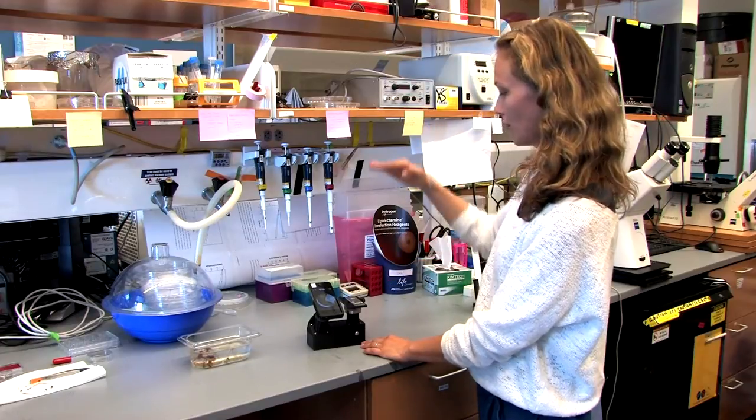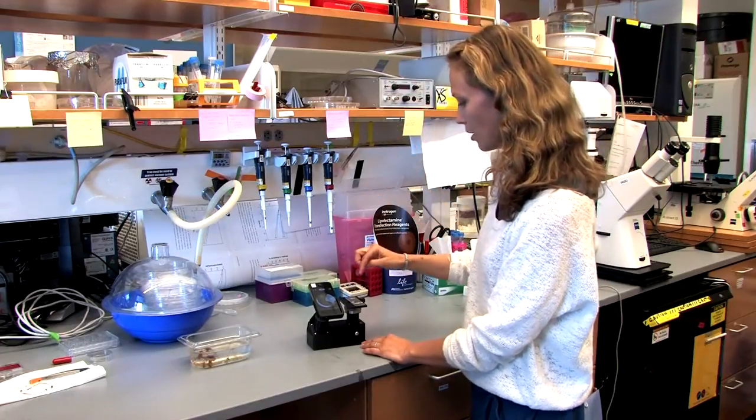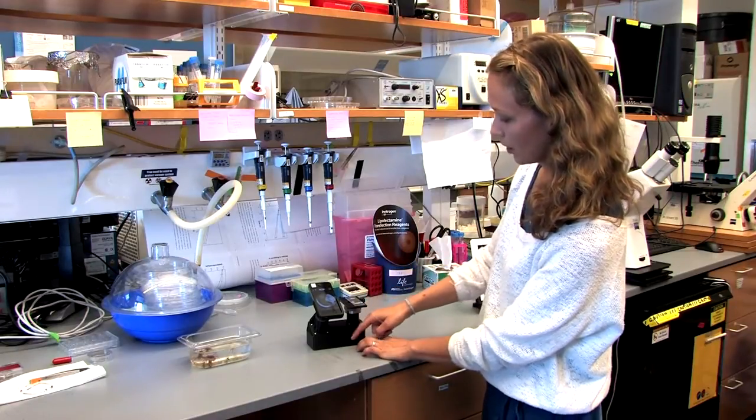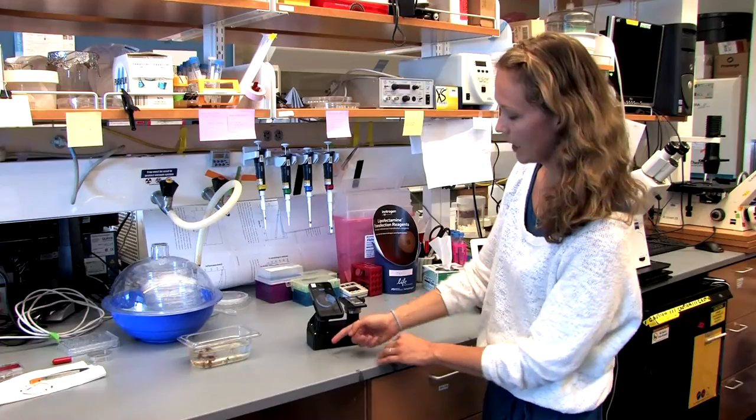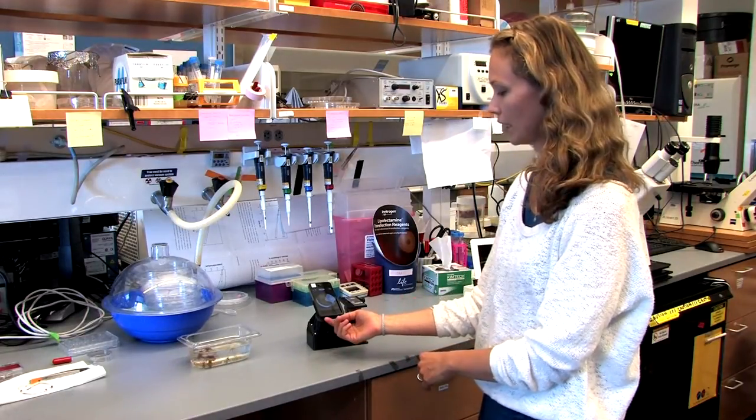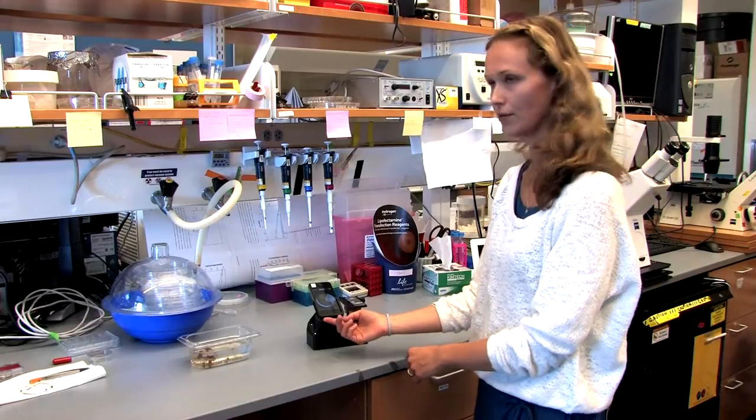And the light comes in just from the room lights in this case. It goes through the sample into the magnifying lens here, and the light goes then, it hits a mirror here and it hits another mirror on this side, and is directed up through what's called an eyepiece and goes directly into the camera of the iPhone in this case.